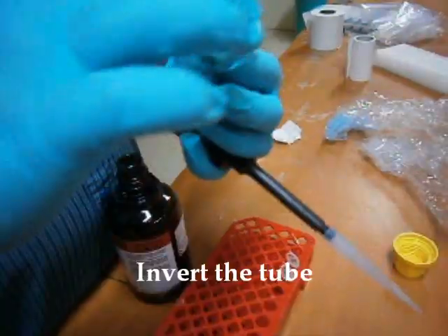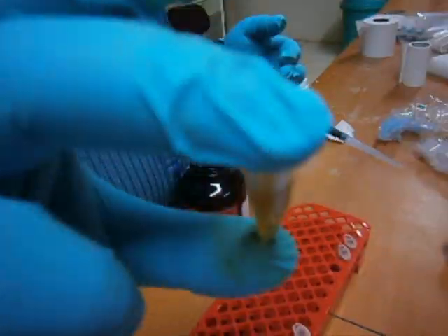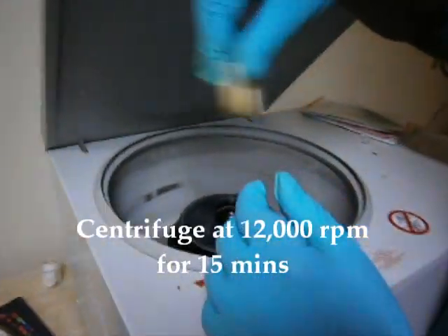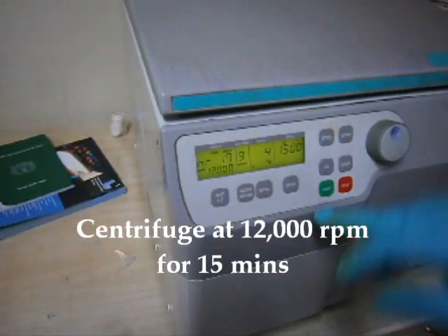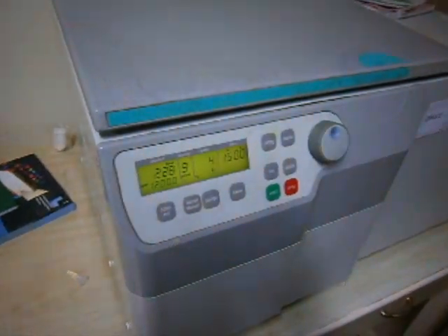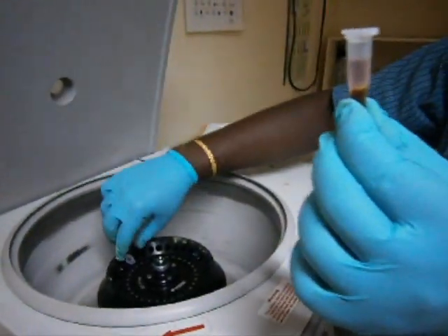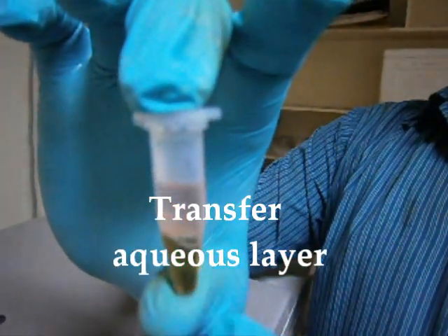The tubes were inverted and incubated at room temperature for 5 minutes. The tubes were centrifuged at 12,000 rpm for 15 minutes at 4 degrees Celsius. The aqueous layer was transferred into a new Eppendorf tube. It contains RNA.